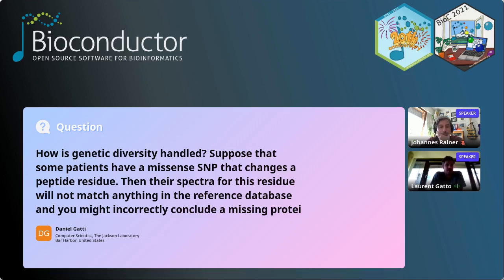If you know that your modifications induce changes at the protein level, when you run your identifications, you could indeed use multiple protein sequences per protein in your protein FASTA file, including some sequences that account for the modifications you're interested in. And that will allow you, hopefully, to identify the modified peptide, or the non-modified peptide, because you will have the two peptide sequences in your FASTA file.